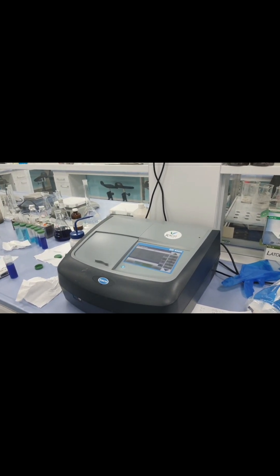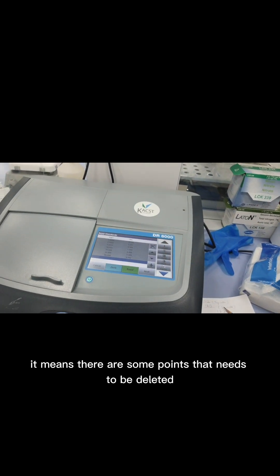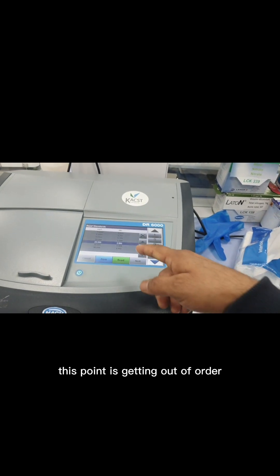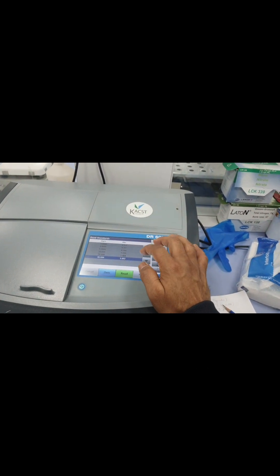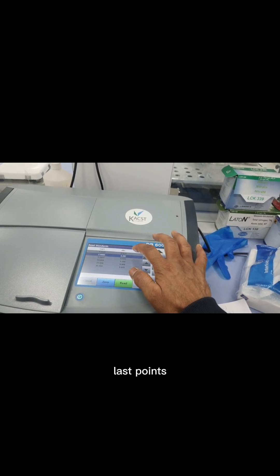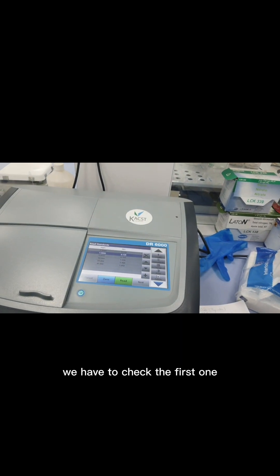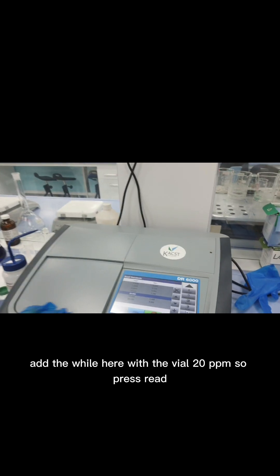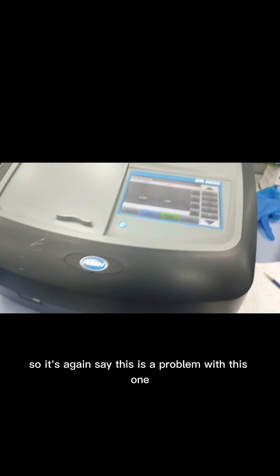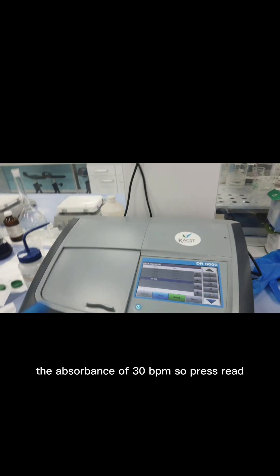The R² value is 0.9470, which means some data points need to be deleted as they are going out of order. We delete the outlier points one by one and check again. We re-read the 20 ppm standard — there is still a problem with this point. We then re-read the 30 ppm standard and press Read.